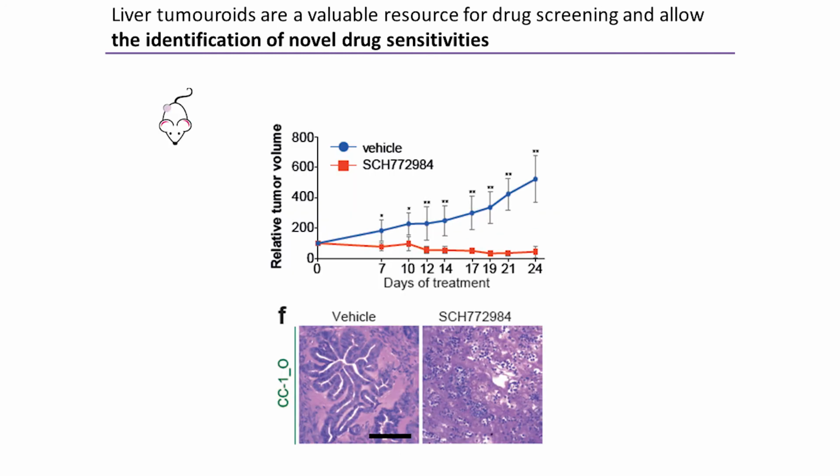We took some of the sensitive and some of the resistant, and here I'm showing you the sensitive ones. We showed that when we treat the tumor, when it's a real tumor, you can really visually see it, and when you treat it, the tumor shrinks, and what we saw is that these are all TUNEL-positive cells, while the vehicle grows, as we know, as this glandular epithelium.